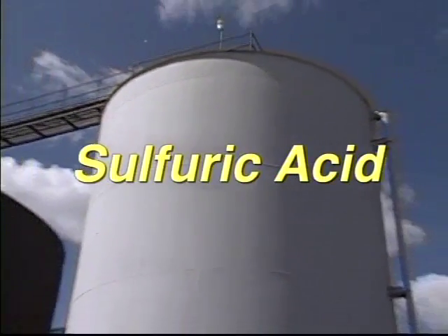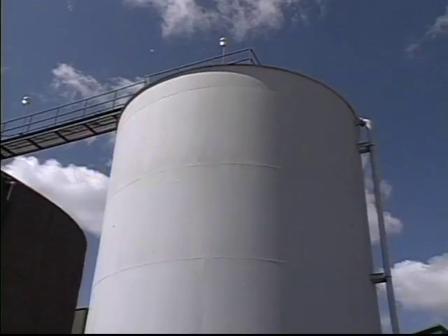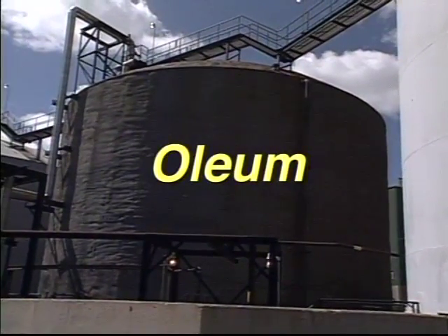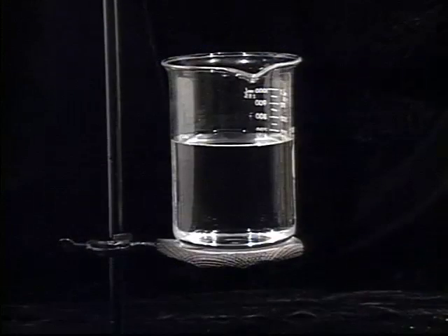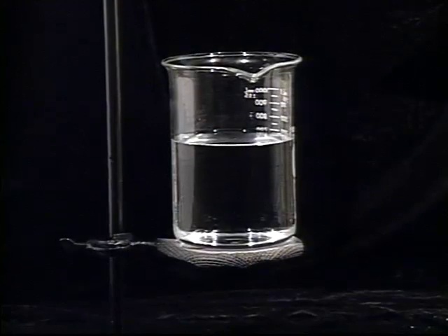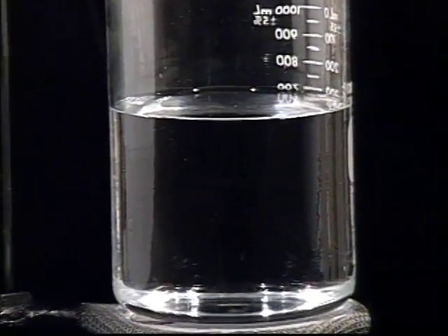Sulfuric acid is marketed either as a non-fuming liquid or as oleum. Oleum is a fuming acid that requires special safety procedures that will not be covered in this video. The more common non-fuming form of sulfuric acid is clear, odorless, slightly oily, and gives no hint of its highly reactive and corrosive nature.